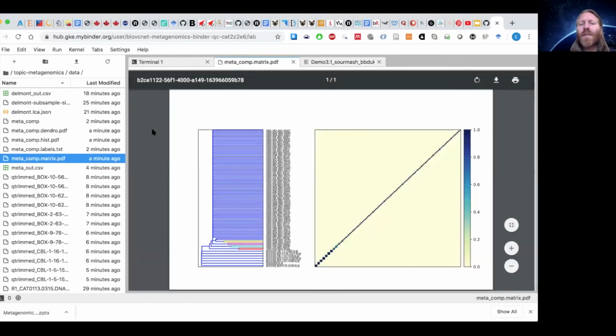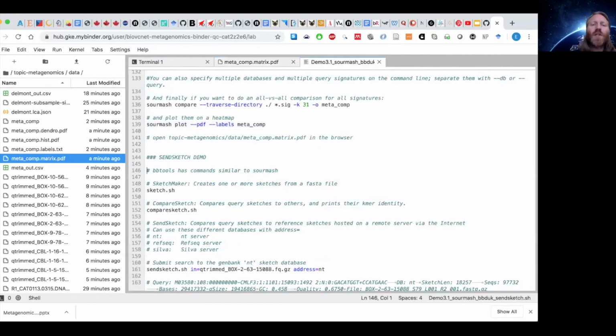Okay, so that's the end of the sourmash tutorials. I just wanted to touch for a couple minutes on SendSketch, which is built into the. Oh, sorry, there's a question. Do you do K-mer correction before running sourmash?